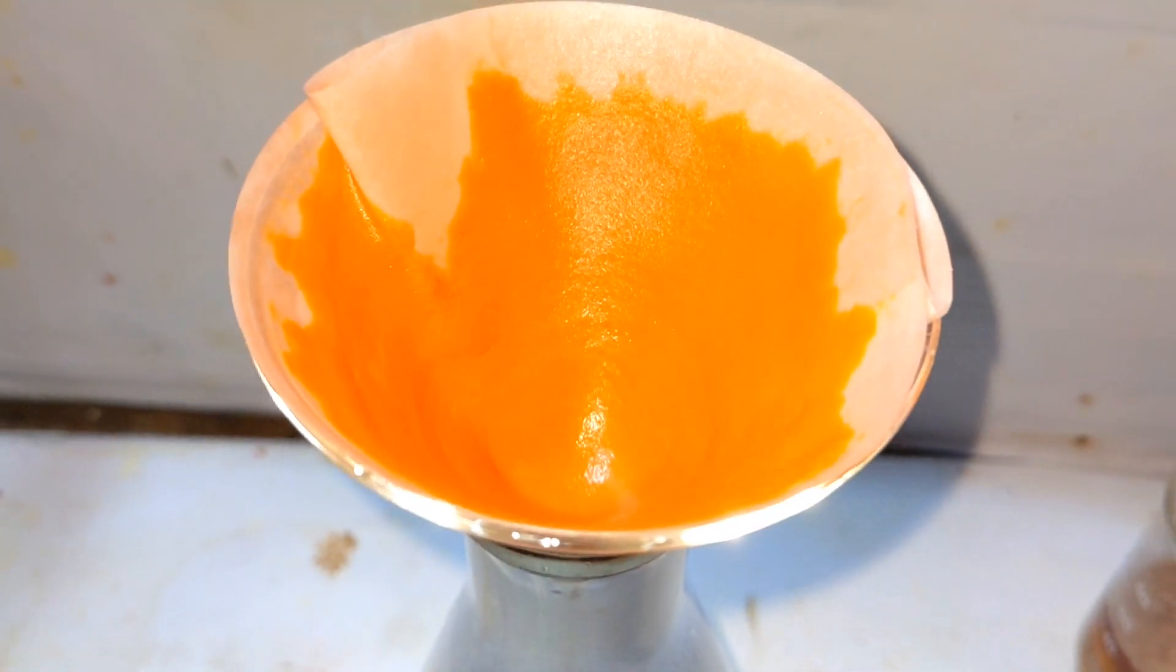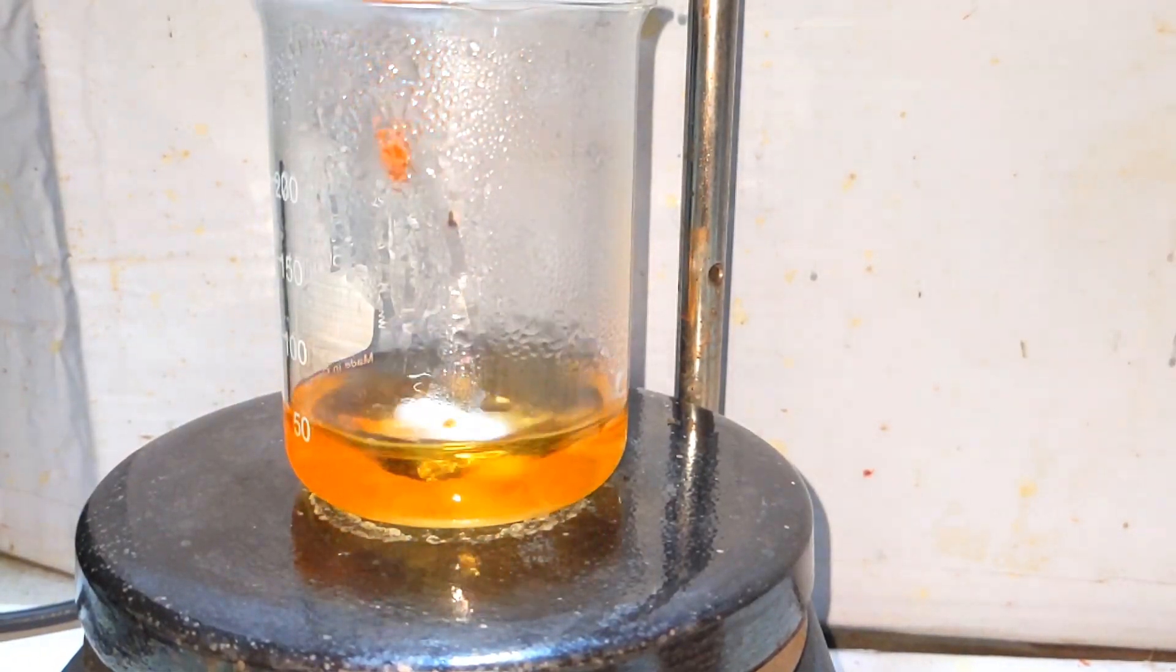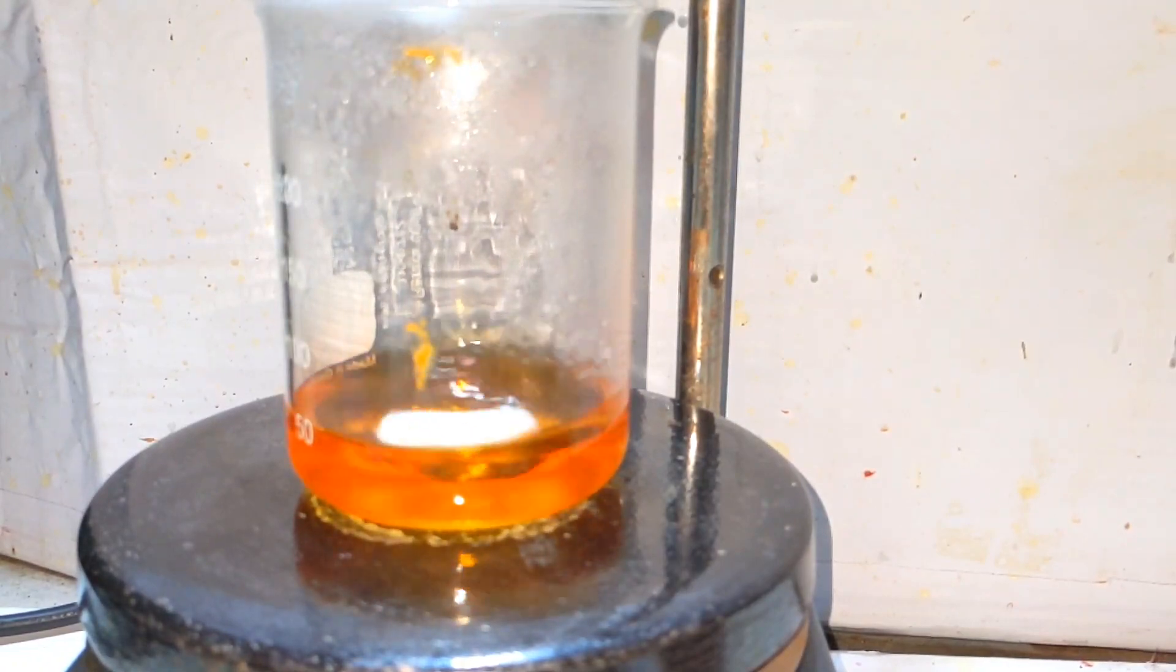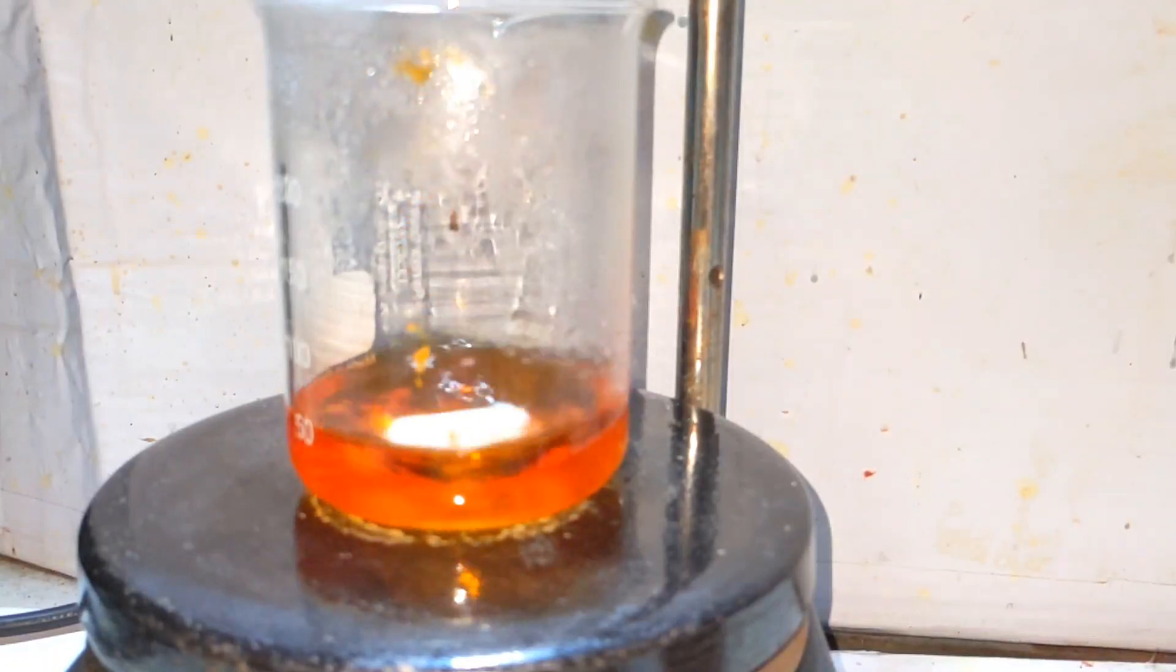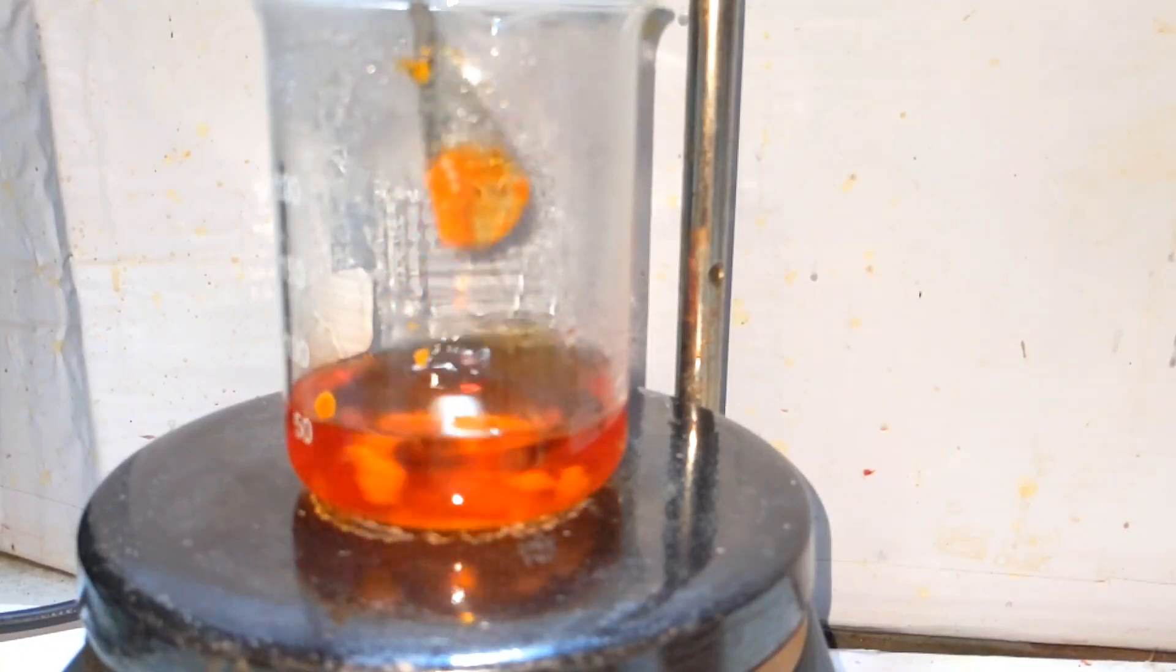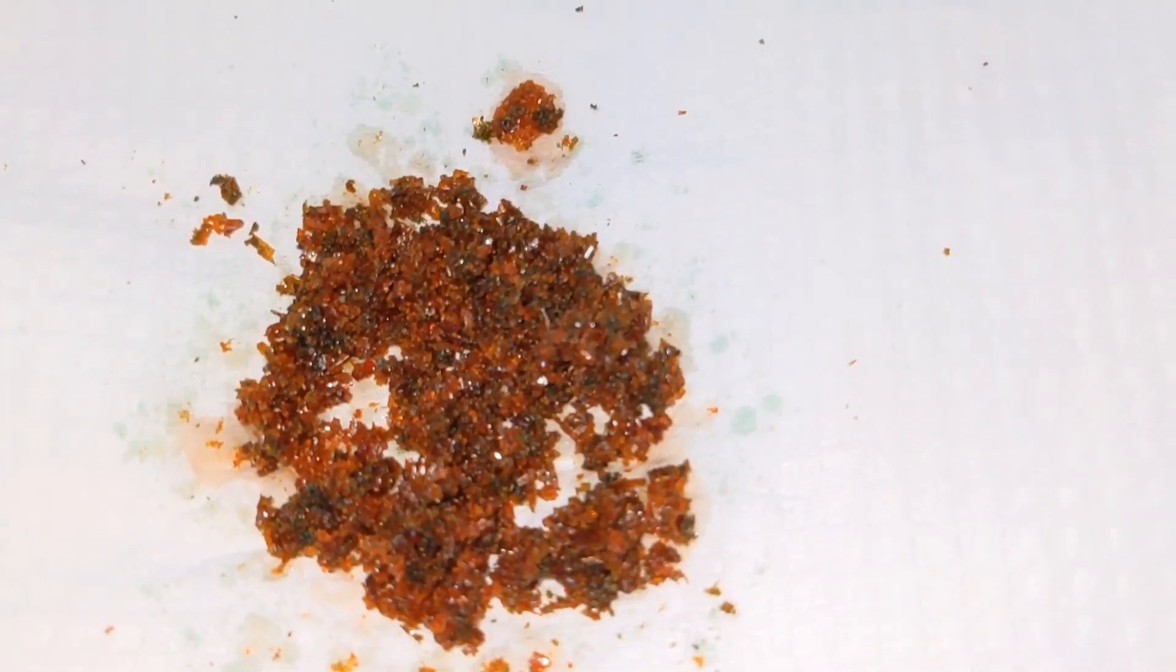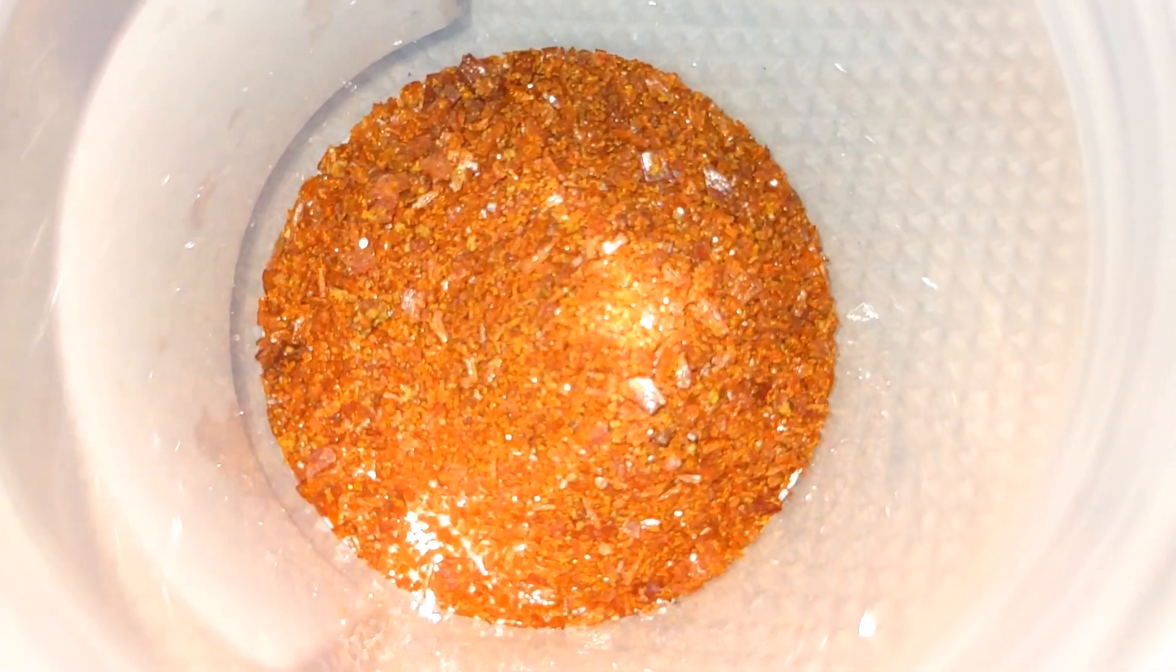And here we have the crude product. Now to recrystallize the compound, the recrystallization of this compound is very easy and can be done using hot boiling water. This compound is soluble in hot water, so almost all the compound was added to the hot boiling water. I am taking around 50 milliliters of water here. On cooling, the crystals separate out which I then dried using tissue paper and this is the final product.